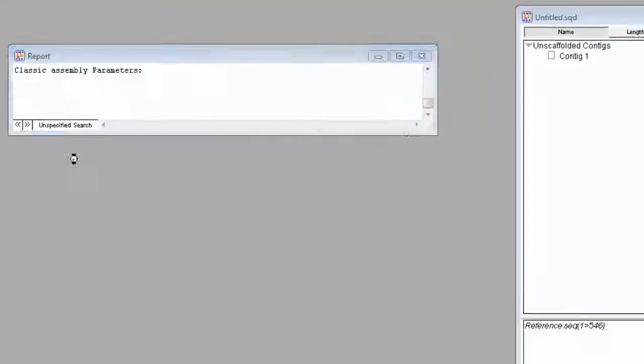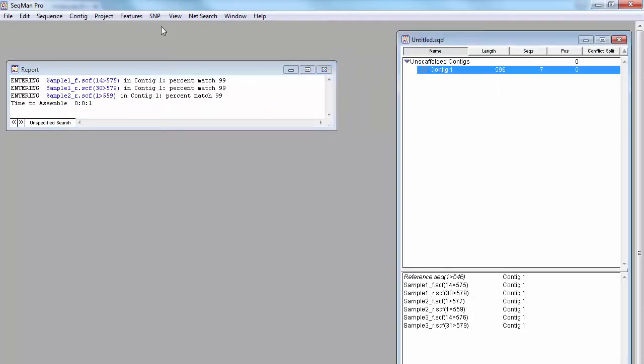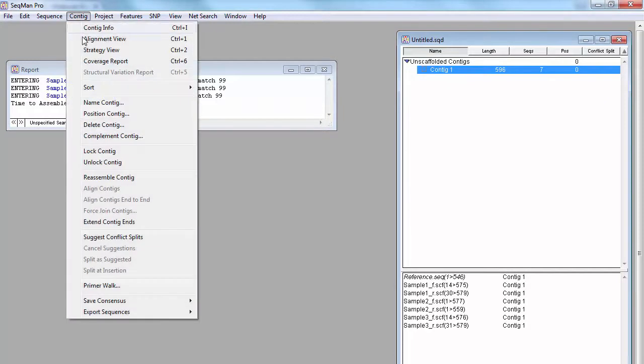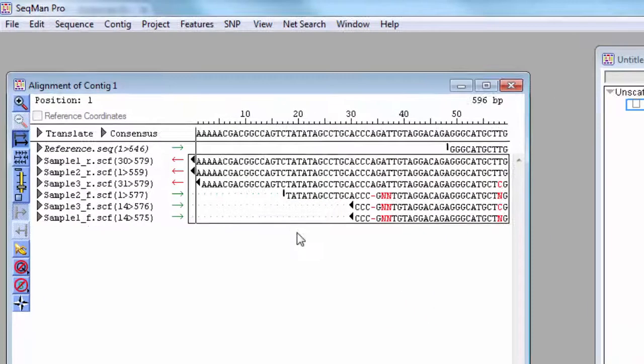This uses our patented algorithm for evaluating trace data, which judges peak quality, resulting in a more accurate consensus compared to the majority method.